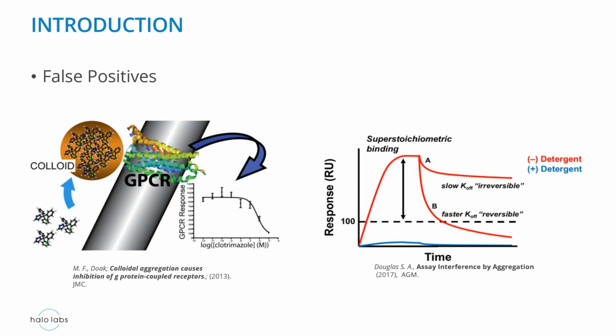They are very, very credible hits until you, for example, in this case, put a little bit of detergent that helps solubilize the chemical, and then the effect goes away. Right now, if you're doing drug discovery and you're at this stage, you have to start studying the solubility of your compounds. Otherwise, it will lead you into this wild goose chase, and at the end, you will have spent a lot of resources on something that is just a beautiful artifact.